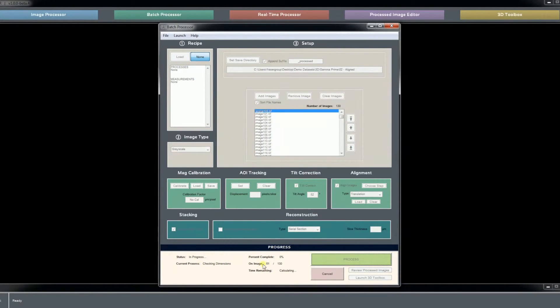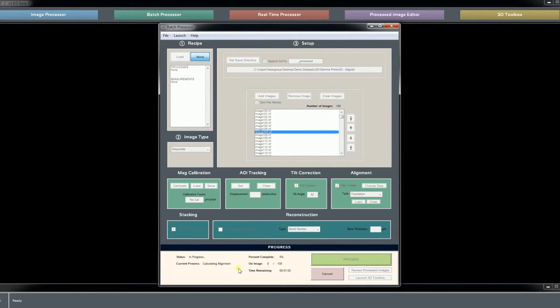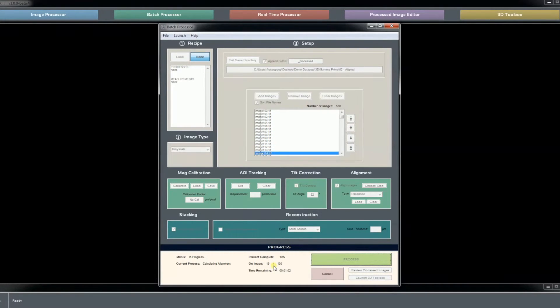What it is first doing is quickly checking the dimensions of all of the slices to make sure they are the same. Now it is running through each slice and aligning it to the previous. Feel free to skip ahead to the end of this alignment — I will just let it run through in real time. If you do not want to watch all 130 slices be aligned, feel free to skip ahead a few seconds.